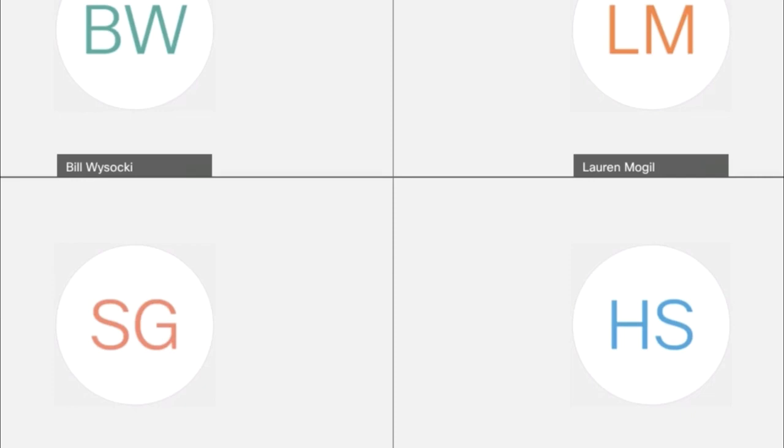Okay. And will you annotate clusters generated by Seurat? Lauren, I'll turn that one over to you. At this point, we were not provided with that. I think this is what you're talking about as far as cell type annotation. We did not have that available, but I think that can definitely be available in the future.